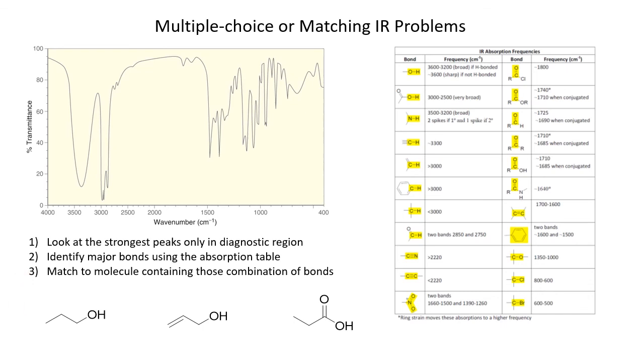So we are going to focus from here on. There's really two major peaks that we need to characterize. So for the one here, it falls just below that 3000 range. And if we go over to our absorption table, we can see that just below 3000 represents a carbon that is sp3 hybridized bound to a hydrogen.